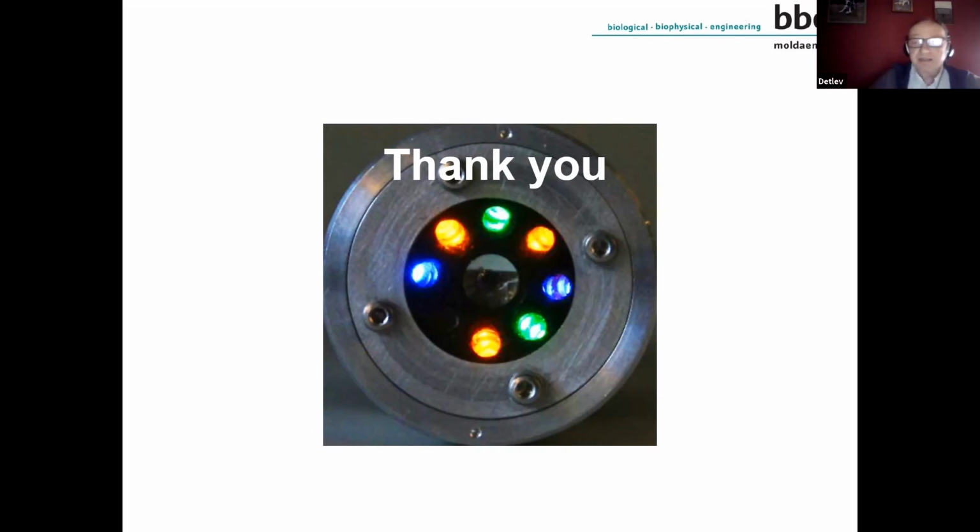Therefore, we can say the algae in nature are very close to the algae that we keep in culture. There could be some reason why we have to reconsider this. For example, when we have the death of algae, then we also find a shift in these spectral features. But it is a very extreme situation, and then you can see it also with the naked eye.